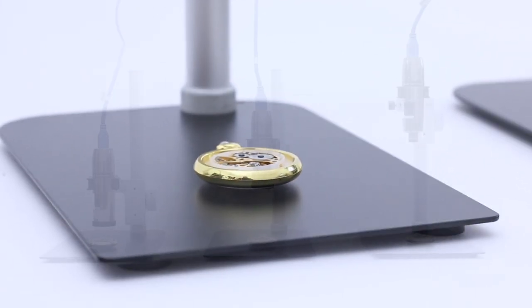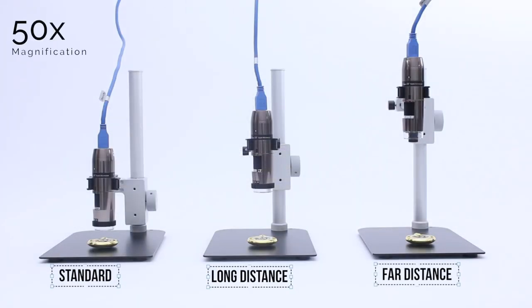Take a look at these models. They may look the same on the outside, but the optics inside are different. Each of them has been set to 50x magnification and positioned so that they are in focus.